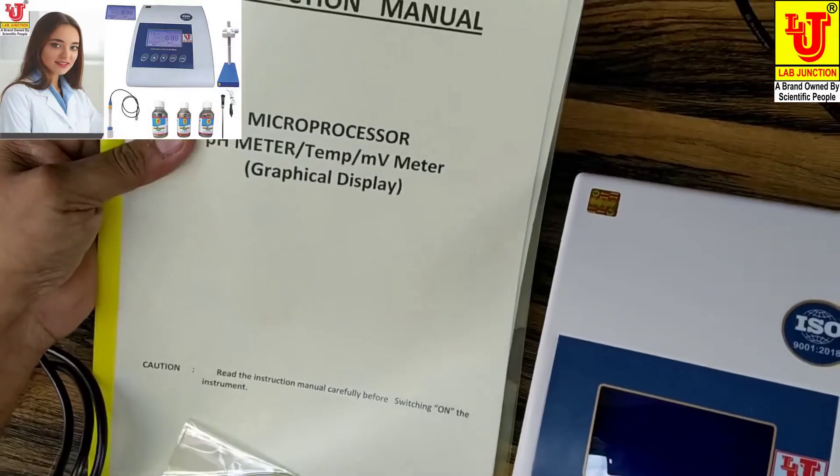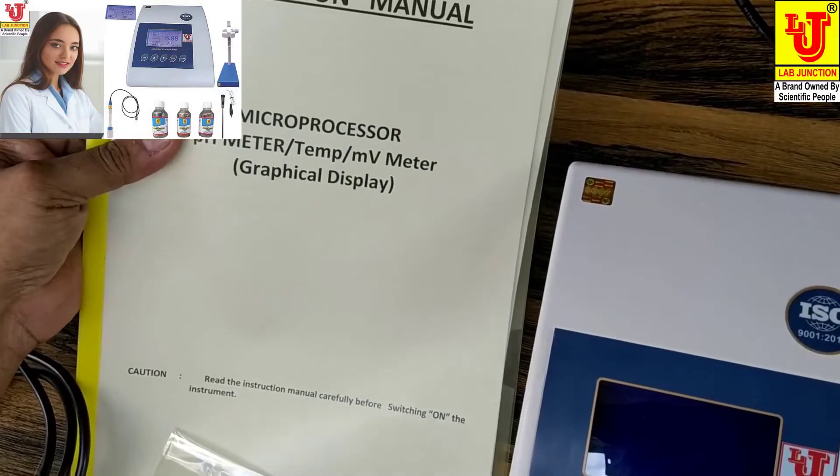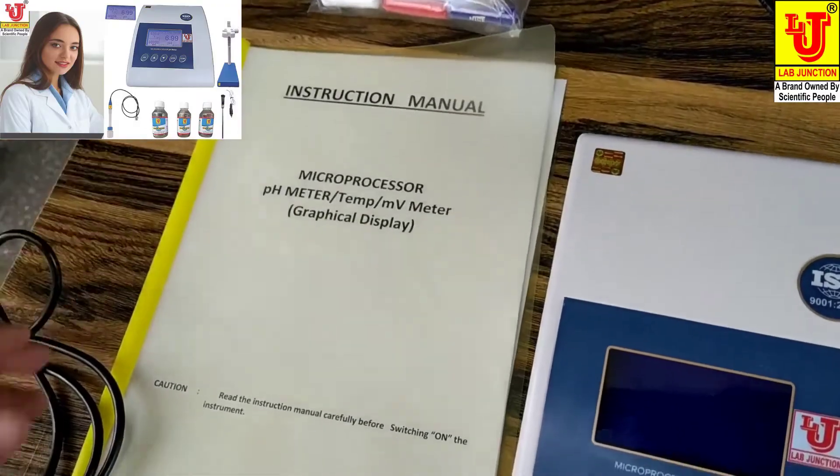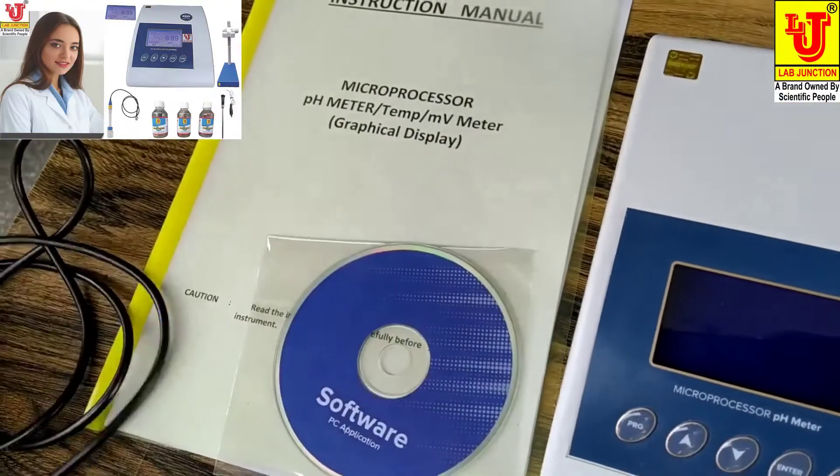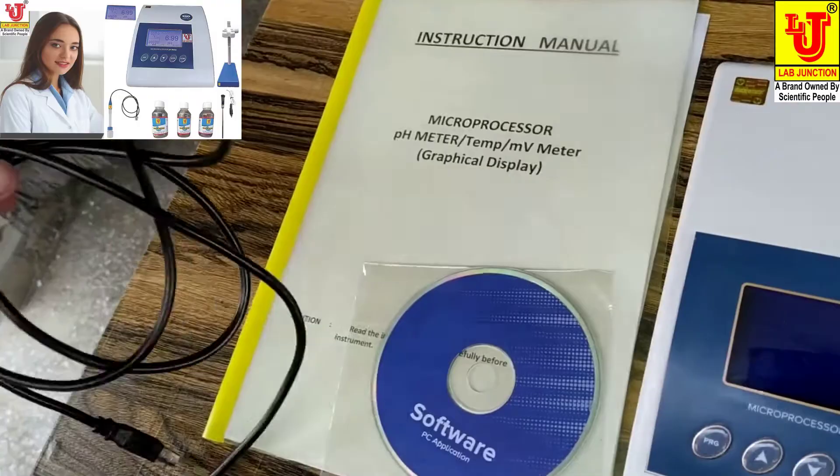Instruction manual, dust cover, warranty card, software CD, and interfacing cable for pH meter.